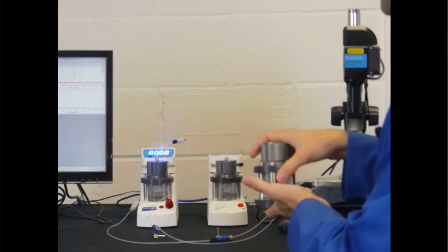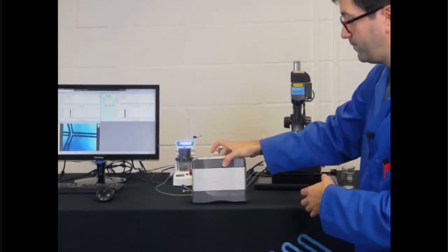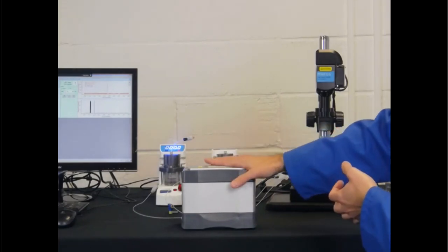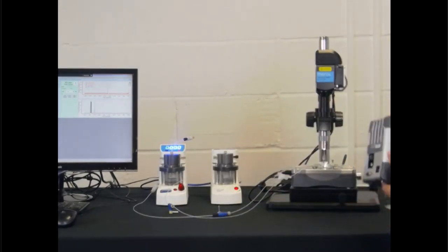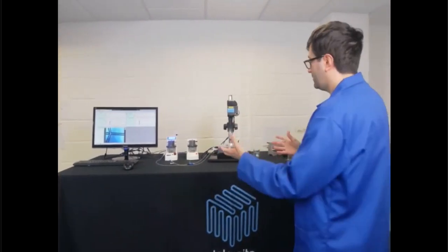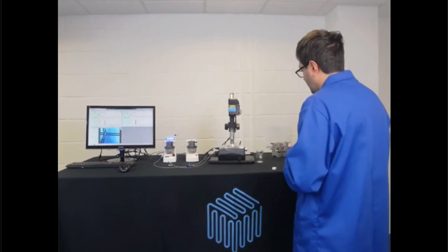So there is a possibility to control the temperature while we are flowing our lipid stream through the chip, and also to control the temperature of the on-the-chip unit. In this case, what you see here is just a holder, but we have the possibility to control the temperature of the chip by plugging in a TC unit, which is a Peltier element, which allows us to set different temperatures and also keep the temperature of the chip at the desired value. And therefore you can run the same application in different conditions, at different temperatures. So as you see, the system is flexible in this way: you can upgrade the basic system with some extra bits and then run your application at different temperatures by plugging in those extra parts.